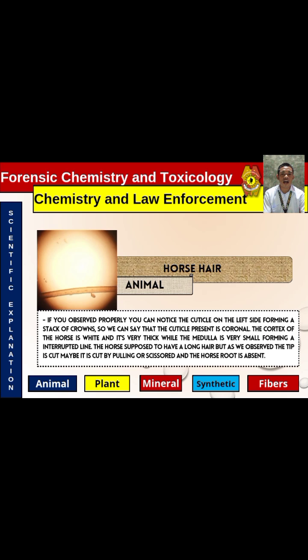Naturally fallen hair has similarities to freshly pulled hair, except that the bulb is still intact. Stretched hair turns the hair into a curl and also reduces its length. In its structure, the medulla is still inside, but it turns similar to the cat, where the medulla is like a bubble, a solid formation.